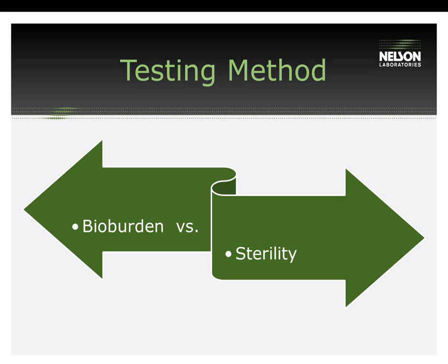When you want to consider which method to use for the validation, you would want to consider bioburden analysis when evaluating individual steps, as Martel went into detail. This provides a log reduction value and helps you understand the effectiveness of the process or the process steps. It also provides recovery efficiency, which is critical to understand the effectiveness of the test method.